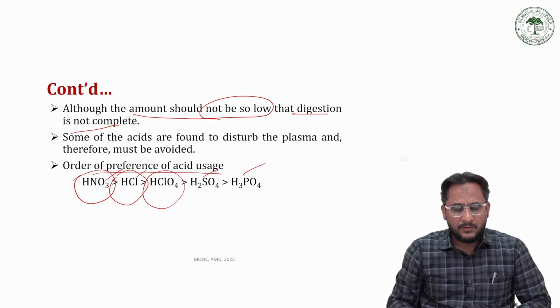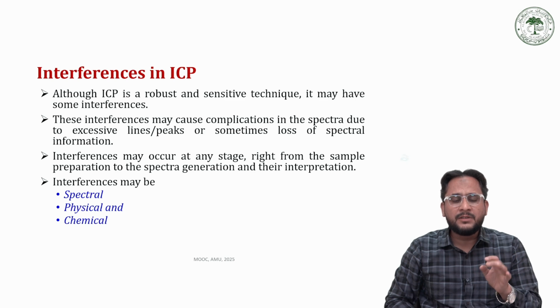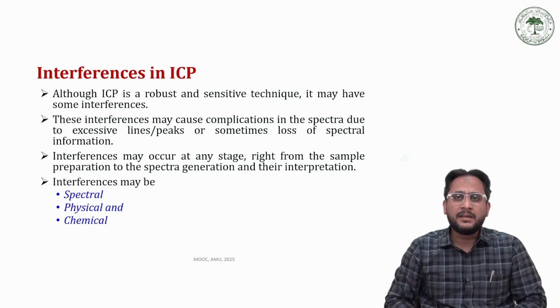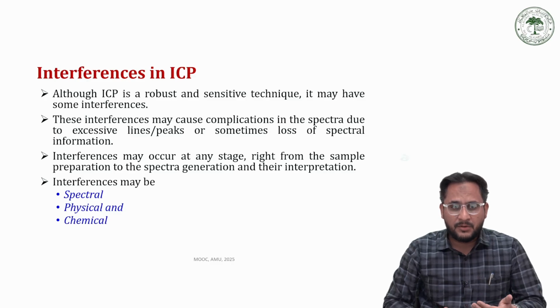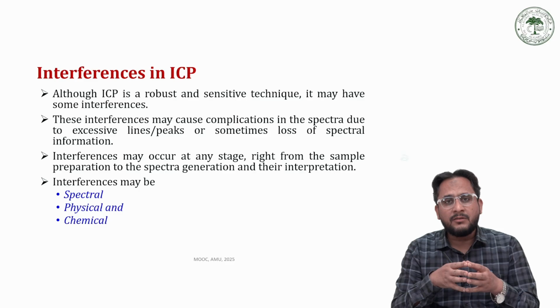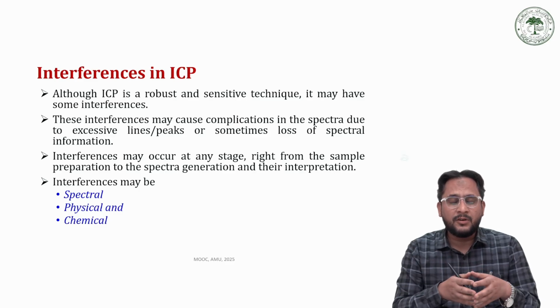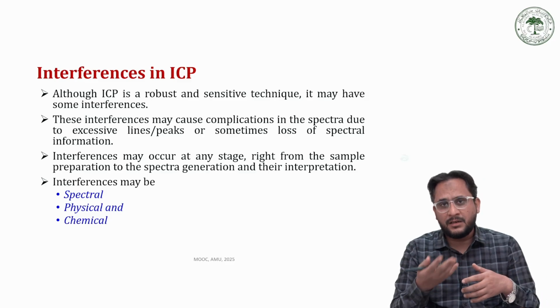Let's move to the next slide. Now let us discuss the interferences in the ICP. Although ICP is one of the most versatile and most sensitive techniques, it still has certain interferences. Since it is a versatile technique, it provides a very high temperature, and because of that high temperature, we always have all the elements present in the sample matrix excited and analyzed.